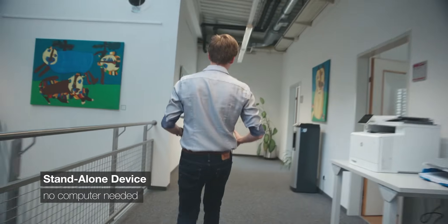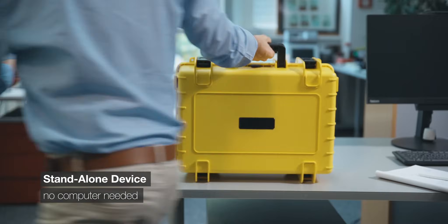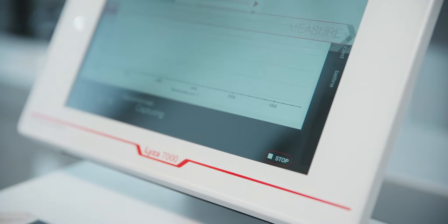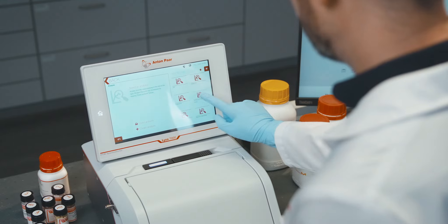It's compact — you can put it everywhere, literally everywhere. It's intuitive; it fits into everyone's workflow and opens up a whole new software world.